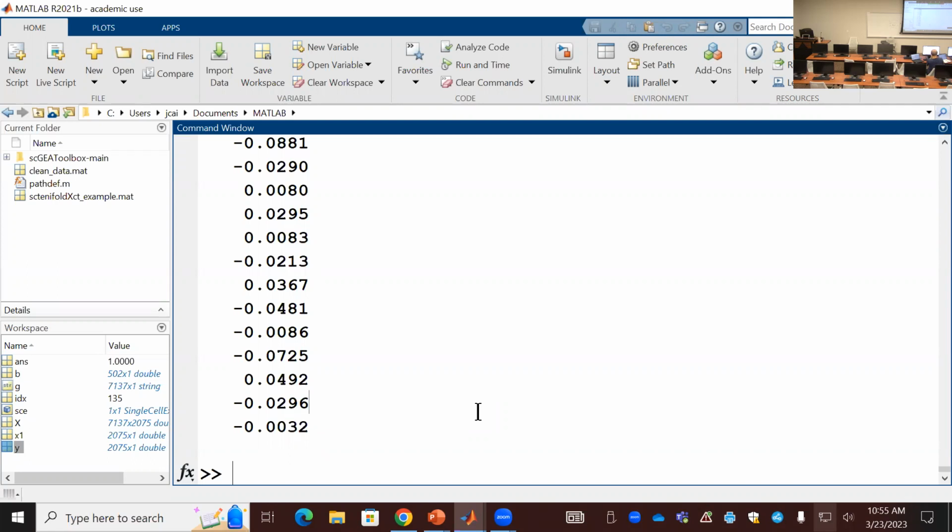You click this button here. No, that's one. Yeah, there's only 23 cells. You don't have to export. You can start directly work on this.